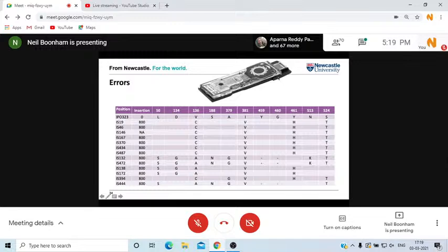There's less. So one run on a flongle costs about hundreds, and you can look at a whole range of different isolates or samples on one flongle. So you could pull together, say, 100 samples, in which case you're getting sequence data for probably about $1 per sample. And this is the output of the sequencing data.